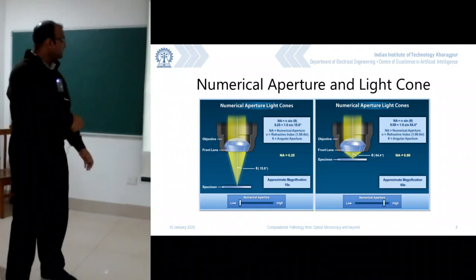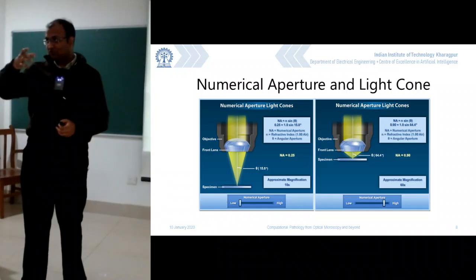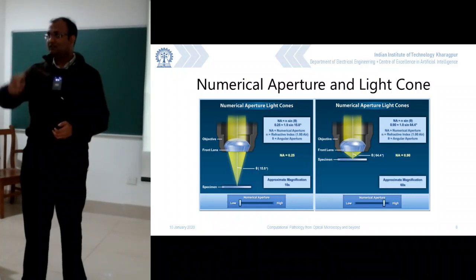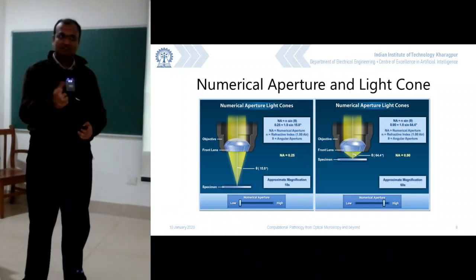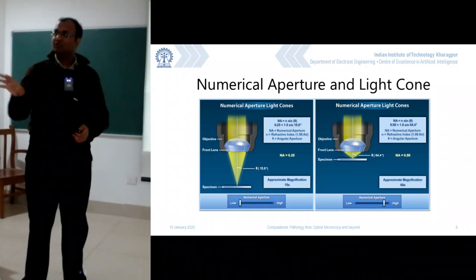So that's another rule which you need to really adhere to, which is you will have to change the aperture so that the maximum aperture control matches the numerical aperture of the lens itself. And in fact, typically when you have a manual microscope, unlike the automated microscopes you saw yesterday where you click on one, what that click does is change the lens, and it will also rotate the aperture control and fit it down over there. So there are 2-3 things which you will have to control, and one click solves all of them.